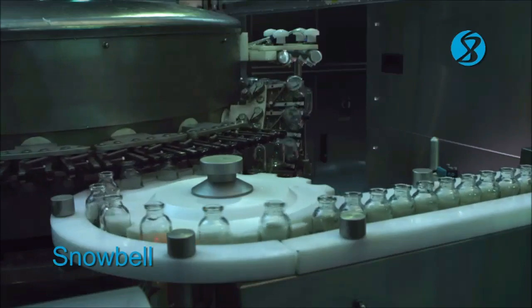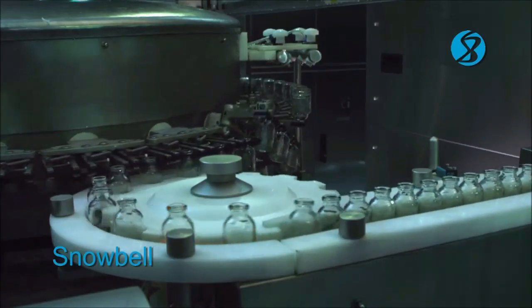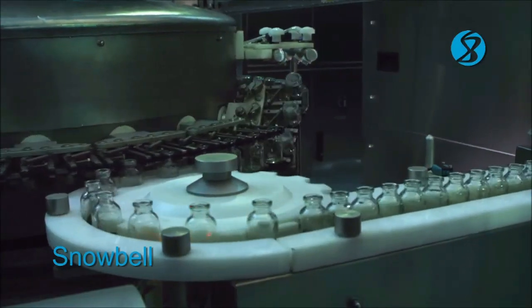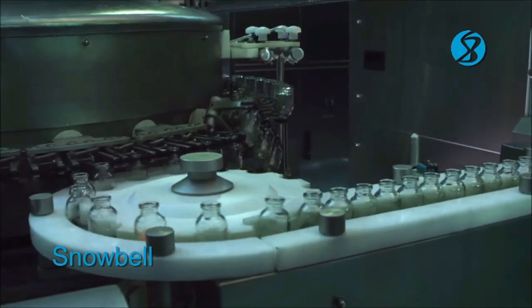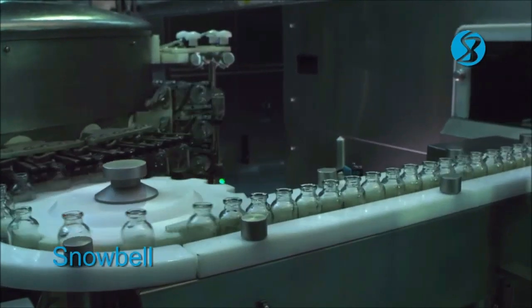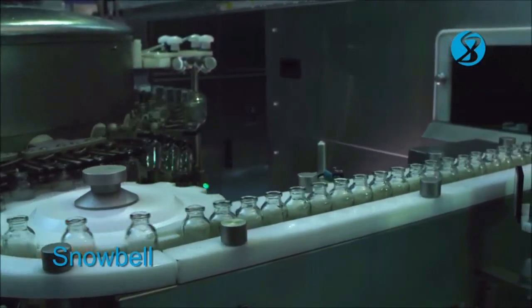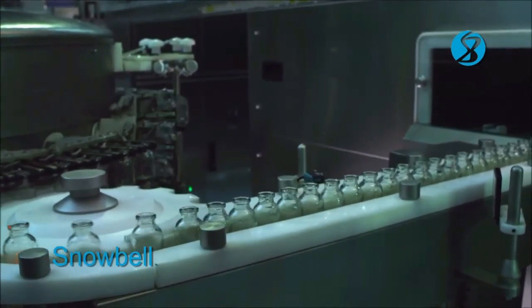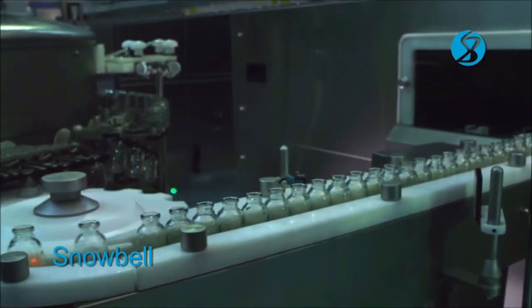After the six-stage cleaning cycle, the vials are withdrawn in a process similar to the entry. The vials are reversed by 180 degrees or FISA and engaged in the slots of an outfeed star wheel from where the vials are pushed back to back to the downline sterilizing tunnel.